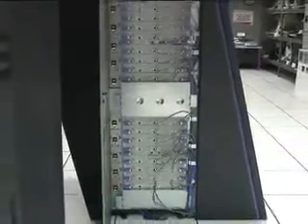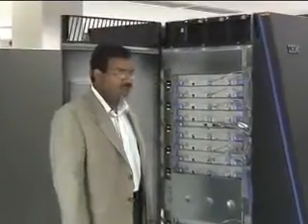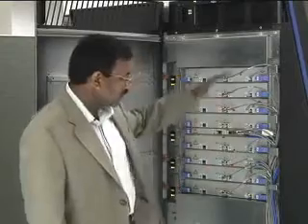Srinivasa Aluru, a professor of electrical and computer engineering at Iowa State and an expert in massively parallel computation, is working with Rajan and other members of the Institute for Combinatorial Discovery to link the Blue Gene's analytical power to the atom probe's prodigious data output.